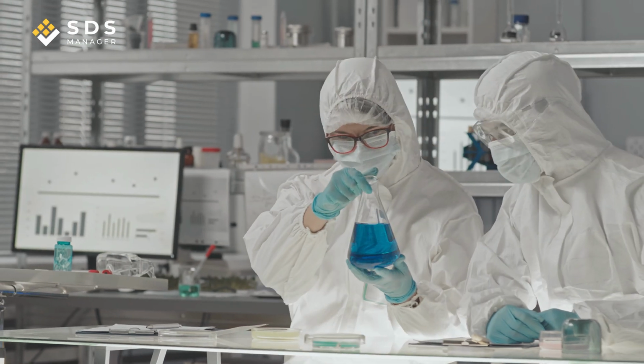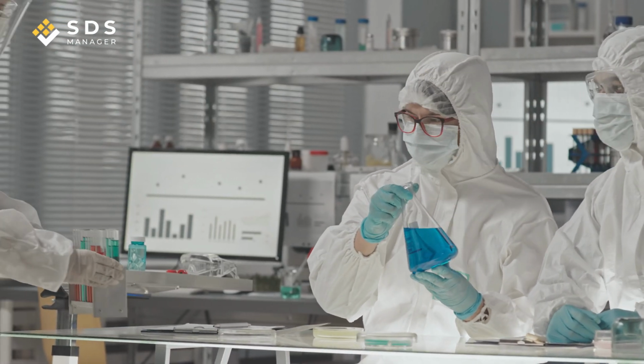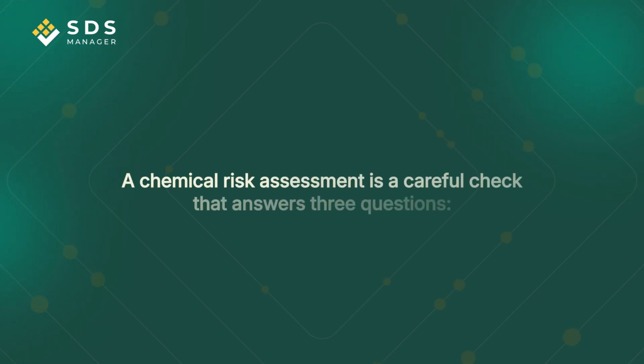Hi, in this video, we will be learning how to conduct a chemical risk assessment. Before we start, let's get an overview of what a chemical risk assessment is and why it matters. Chemical risk assessment is a careful check that answers three questions.